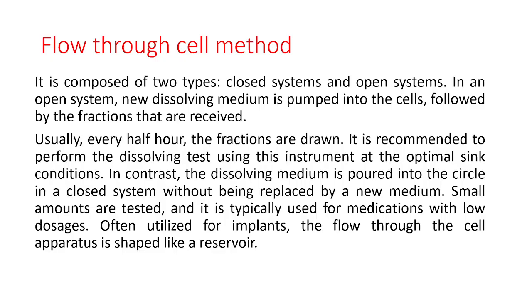The next method is the flow-through cell method. It is composed of two types, closed systems and open systems. In the open system, new dissolving medium is pumped into the cells, followed by fractions that are received. Here, every half an hour, the fractions are drawn, and it is recommended to perform the dissolving test using this instrument at optimal sink conditions.